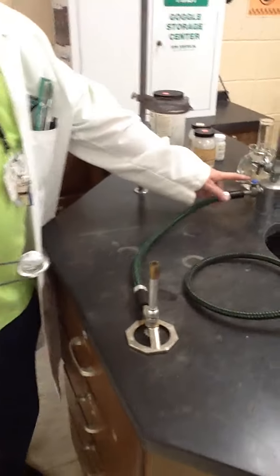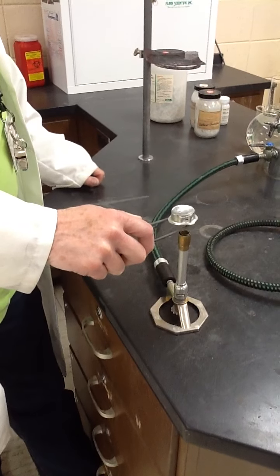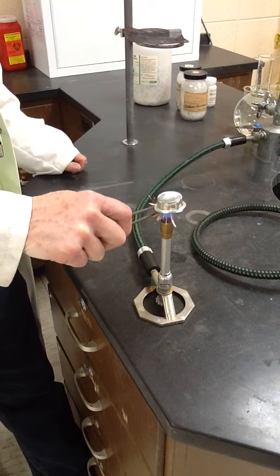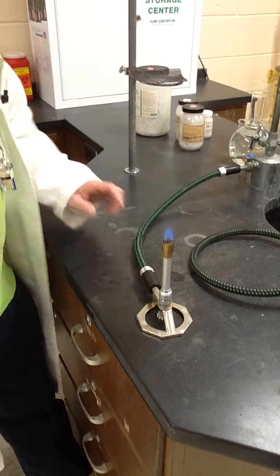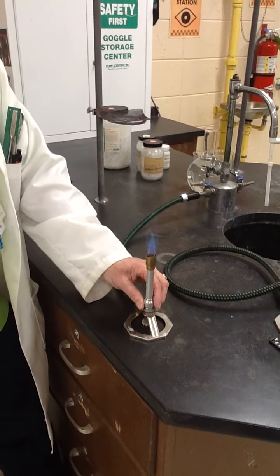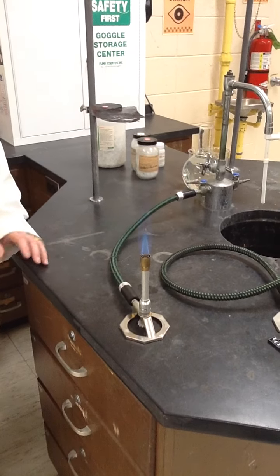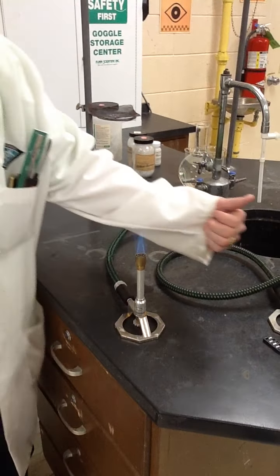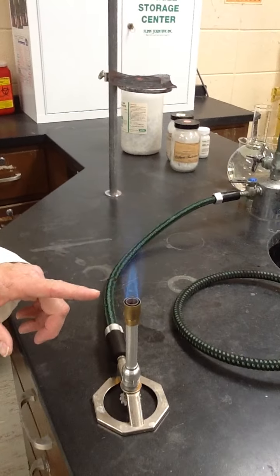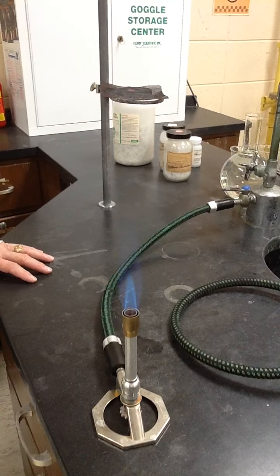I'm going to turn the gas on at the petcock. I'm going to hold my striker, the bell of the striker, over it to capture the gas, and I'm going to spark it. And you can see I can adjust here and adjust the level of gas and the fuel-air ratio. And what I want is a cone of flame, a blue inner cone, and that's the hottest part of the flame, and the tip of the cone is where we're going to do most of our work.